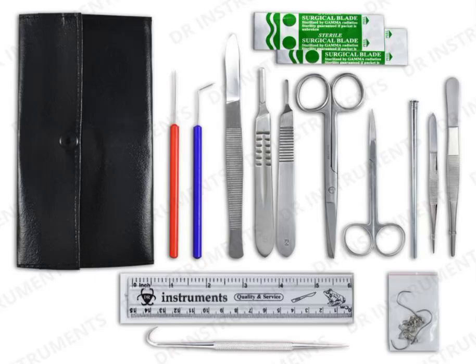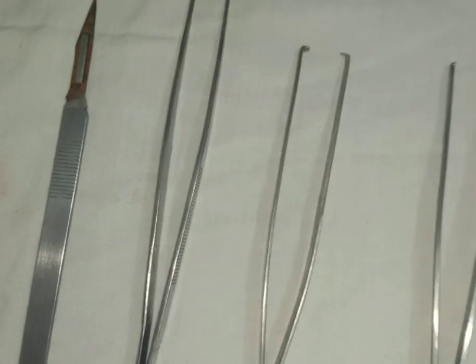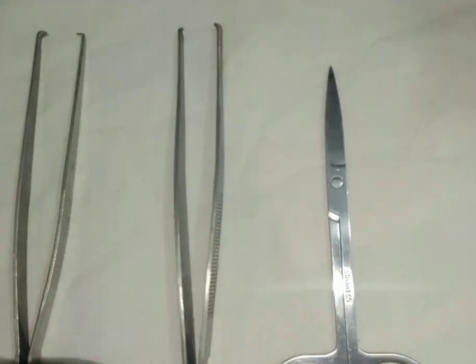Today we are going to discuss dissection tools. Basically, we have a number of tools used for dissection, but not all are that necessary, though some are necessary tools which are sure to be present on the dissection table.